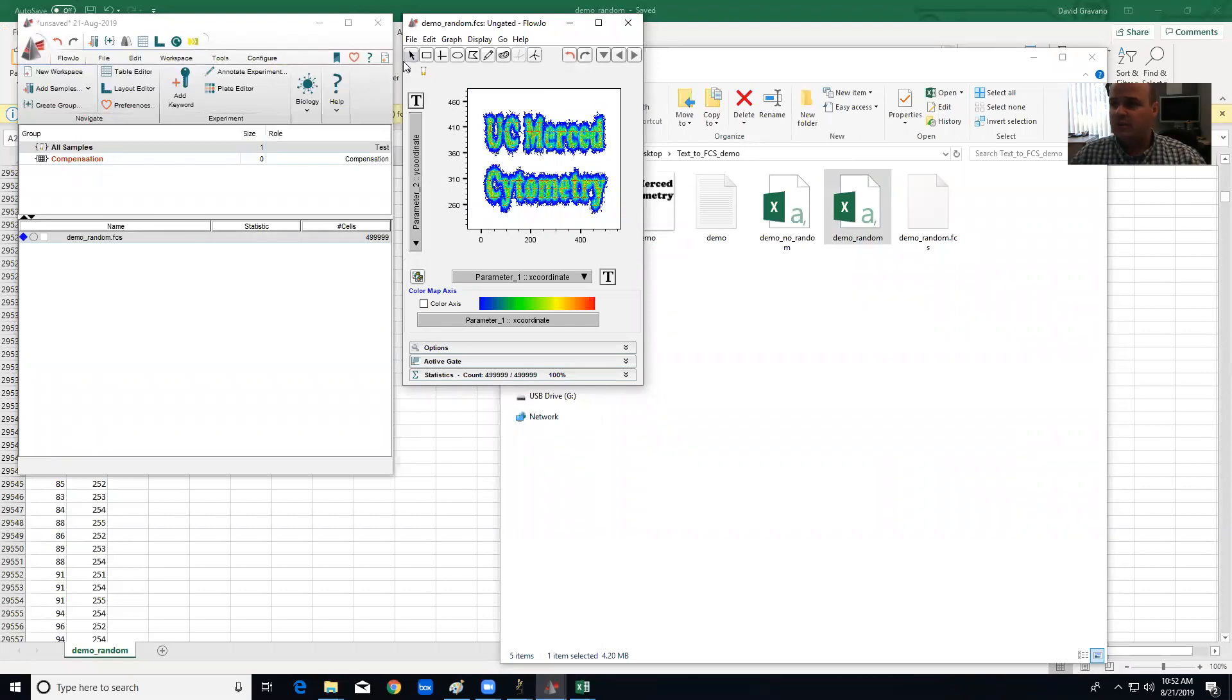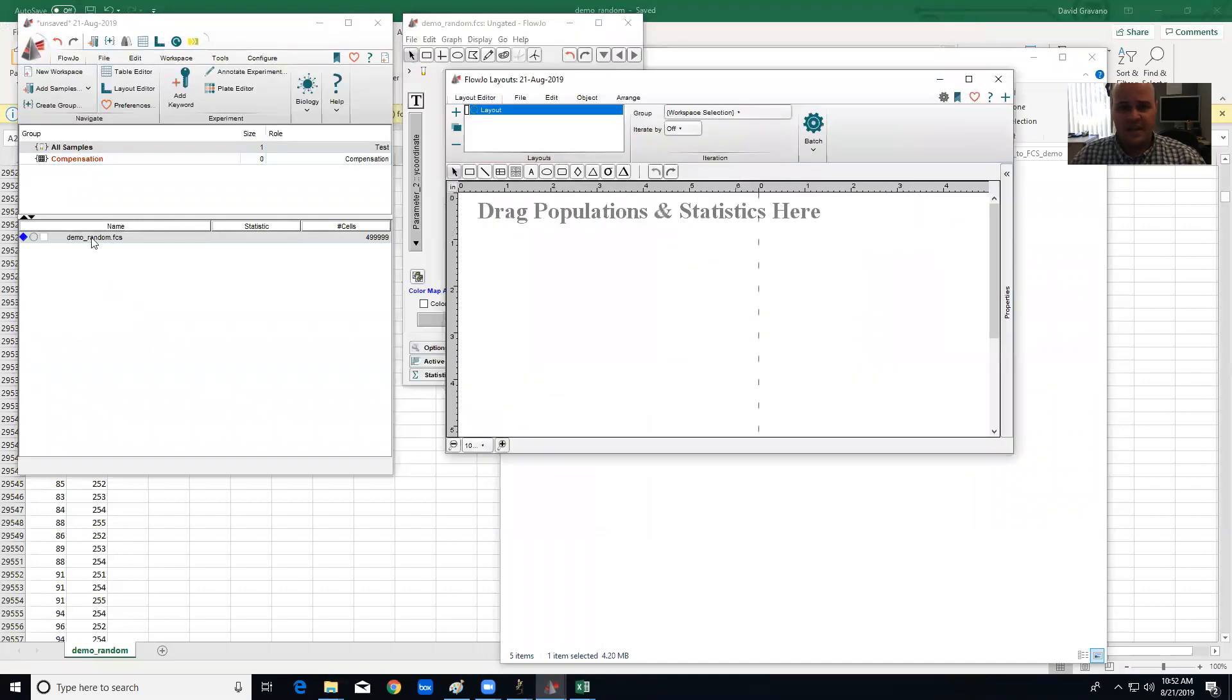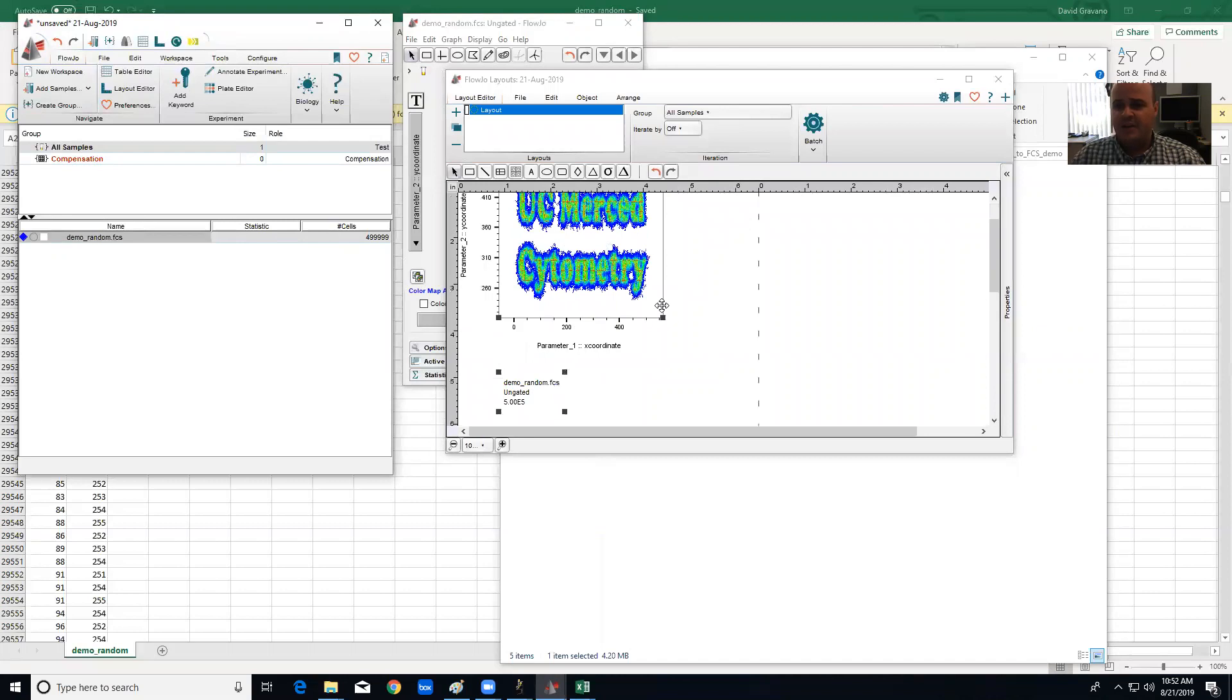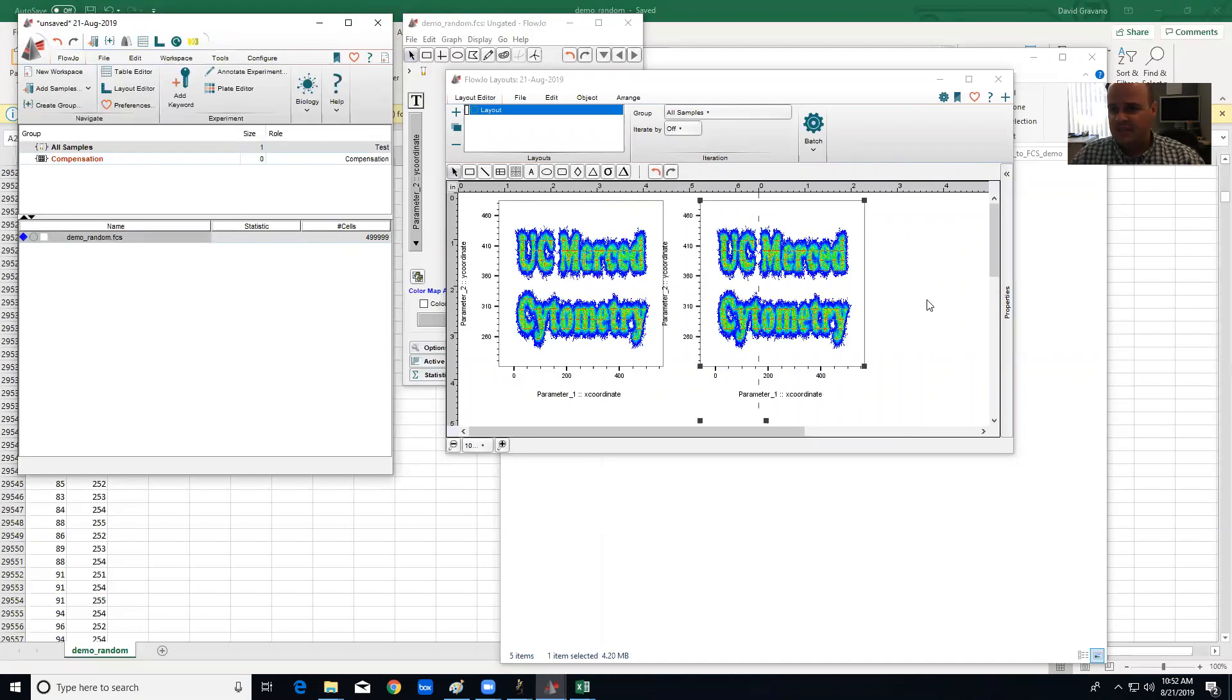And now I'm going to open the layout editor and I can take this data and put it in the layout editor, and I might make two of these.